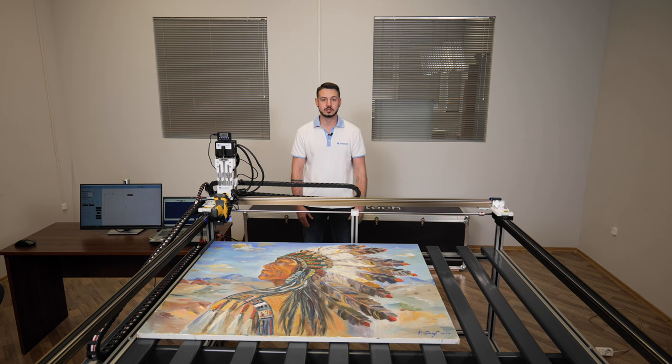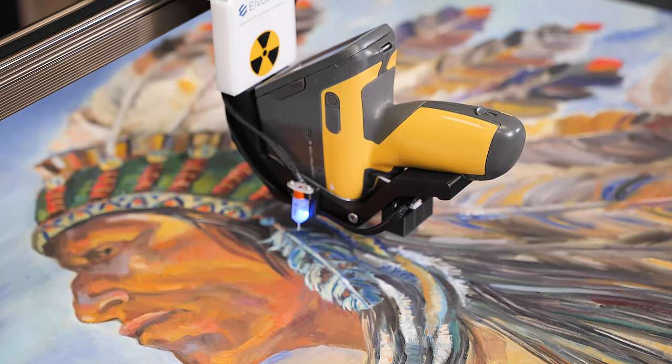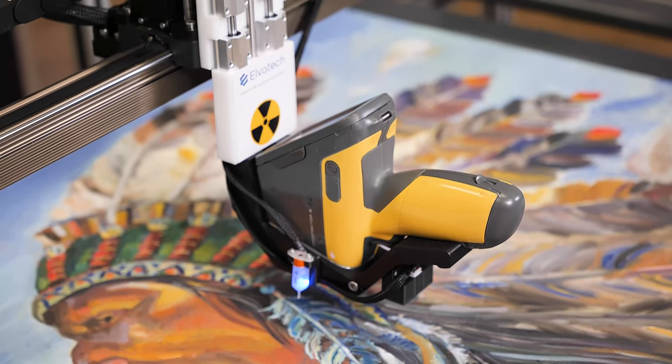Hello and welcome to a review of ElvaX Art from Elvatech, a revolutionary solution for art object analysis. Today we will introduce you to the amazing ElvaX Art Analyzer, designed especially for analysis of works of art. We will see how it can transform the process of analyzing and restoring art objects.